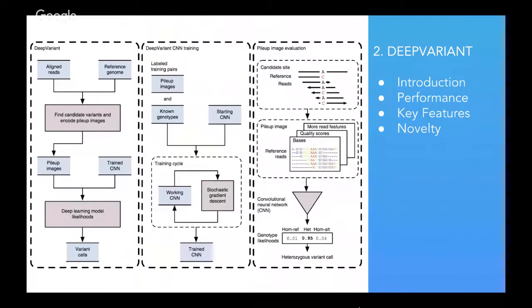After you do the read mapping, which is a prior step that you need in order to train the models in DeepVariant, and get the alignments to a reference genome, what you can get is literally snapshots or images, these pileup images, that are literally all the reads aligned and stacked along your genome.